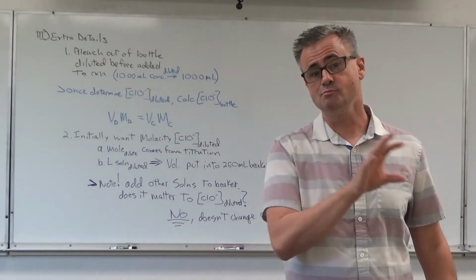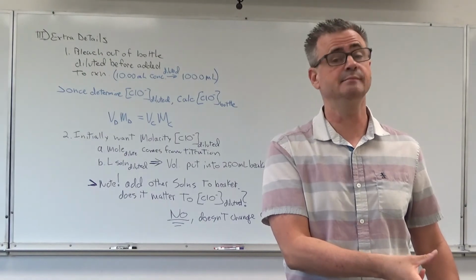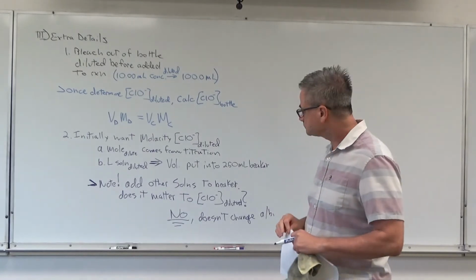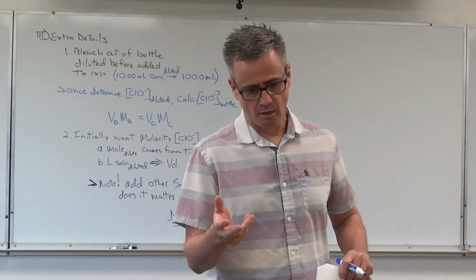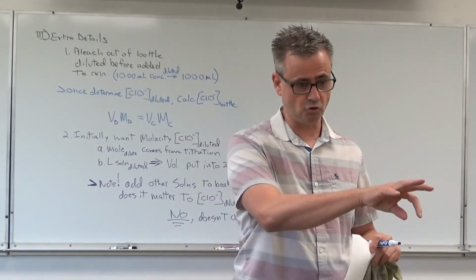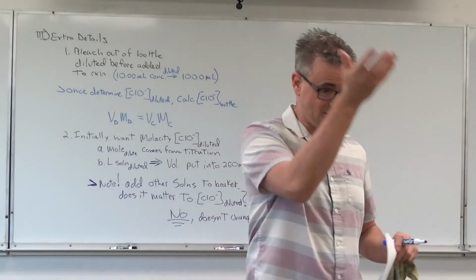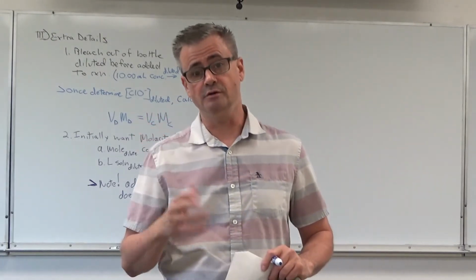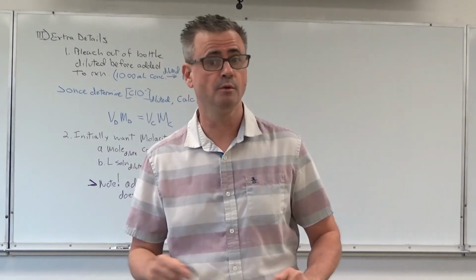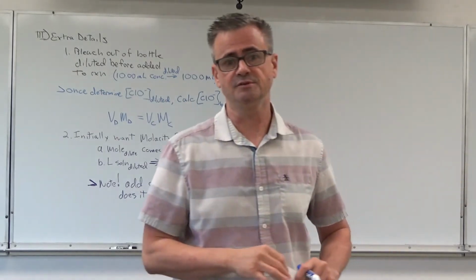When we have the bleach right out of the bottle, we want to be able to convert that into mass percent, right? The value that we have for regular commercial bleach isn't in molarity. It's in mass percent, so we want to be able to make that conversion. A nice way to do that type of thing, where we don't have a specific amount that we're trying to convert, we're just trying to convert a ratio, molarity being a type of ratio, into another ratio, is to pick a volume, or pick a specific amount, I should say, in this case volume.